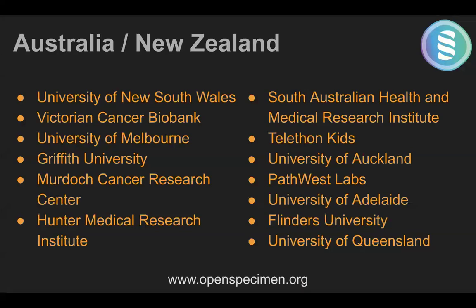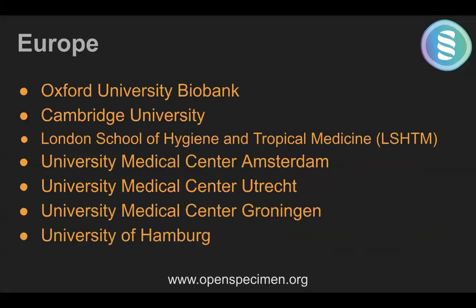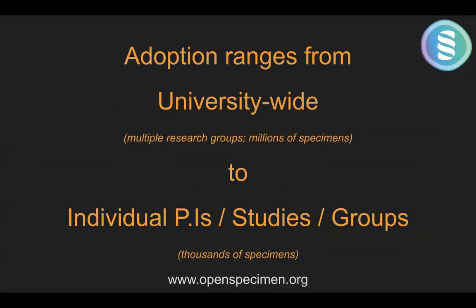Some of these are our Australian clients, European clients. Our customers range from people using it across the university or across the enterprise. For example, Washington University in St. Louis has multiple biobanks within WashU using OpenSpecimen, where, like I was saying earlier, each group can access only their studies and only their specimens, so they get their own compartment.